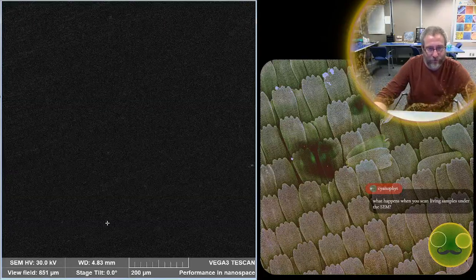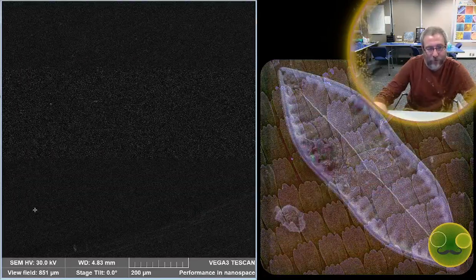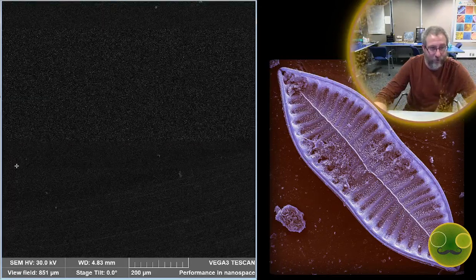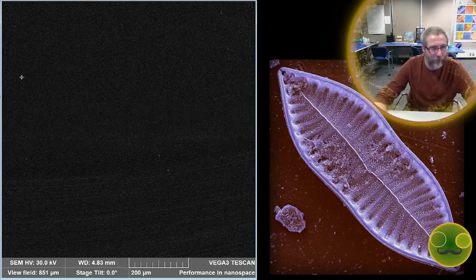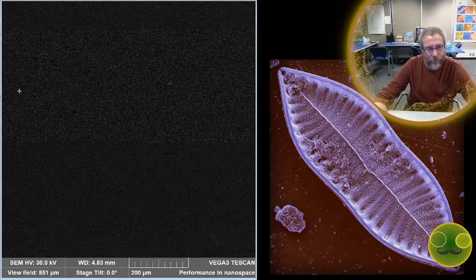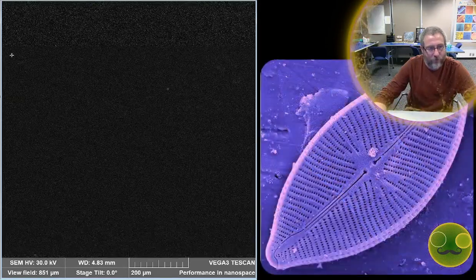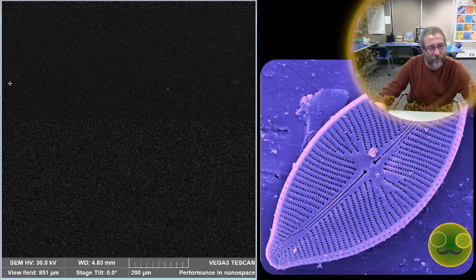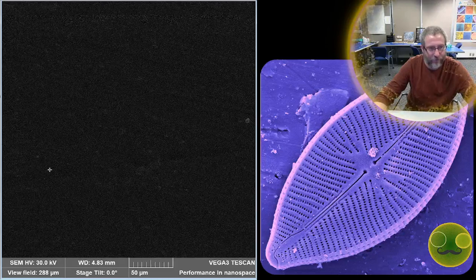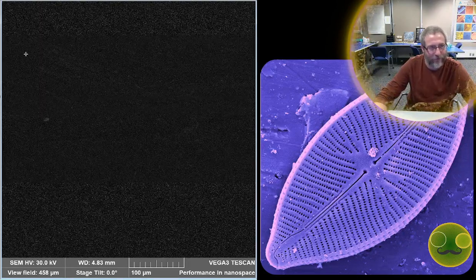For example, if we're looking for lead in the environment, or one of the students whose committee I'm on is looking at bioaccumulation of heavy metals, it might be useful for that. Somewhere I have little tools that show the different interactions and what they produce with respect to where the electrons are hitting, but you could probably just grab something off of Wikipedia that shows that.